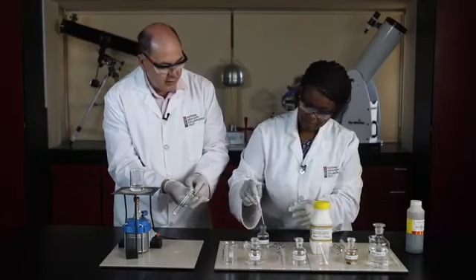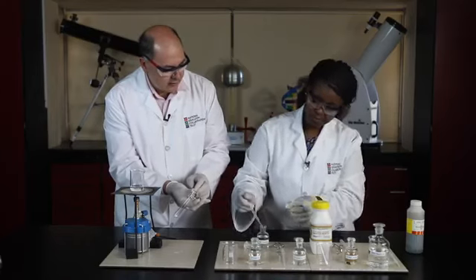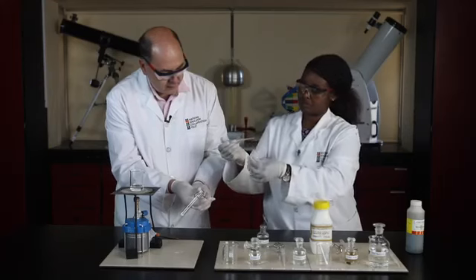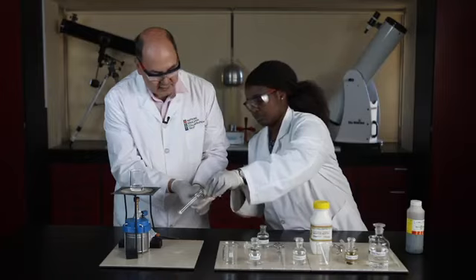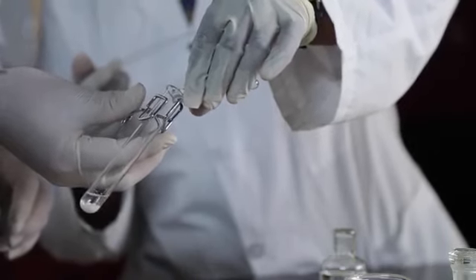So take 3 mL of the methanol and add it to the boiling tube. Shake it around. Now make sure that it flows down so we can get all of that stuff. That's it. Beautiful.